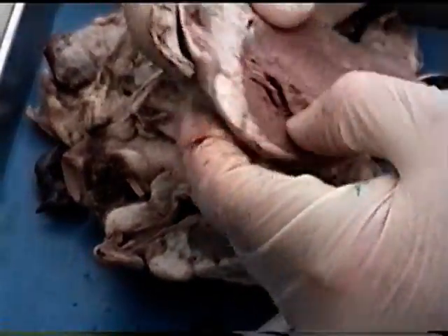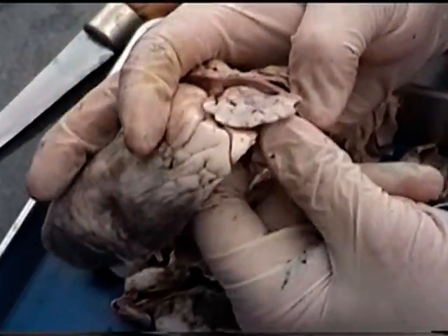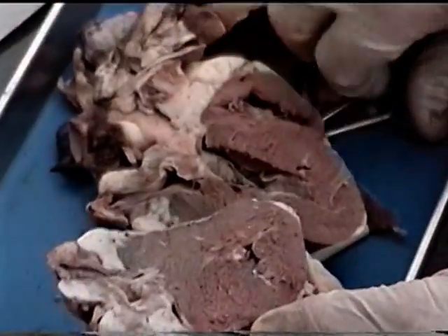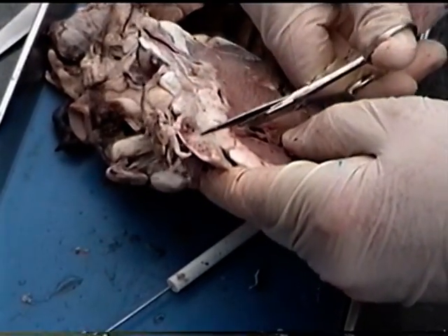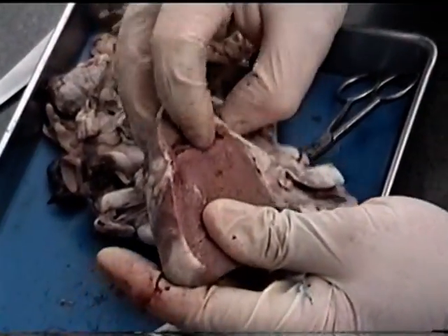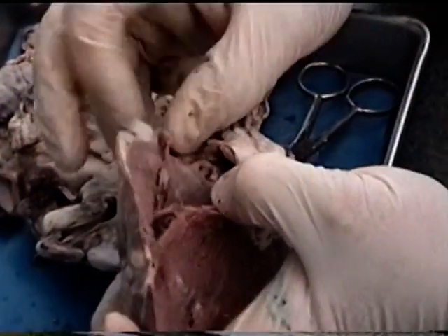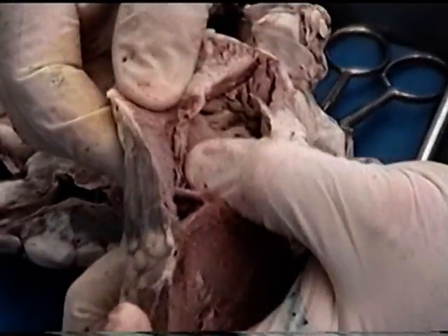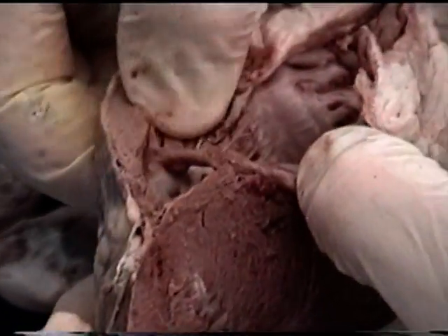So if we look over here on this side, then what we'll be able to see is that this is the right atrium that was leading to the right ventricle here. And if I cut through that, we're going to be able to see the valves again that connect those two. So I'm going to open this up for you so you'll be able to see it. And then as we were just talking about, here is a flap of a valve. Here's the chordae tendineae associated with that valve, papillary muscles, again, as we see the parts of the valve.